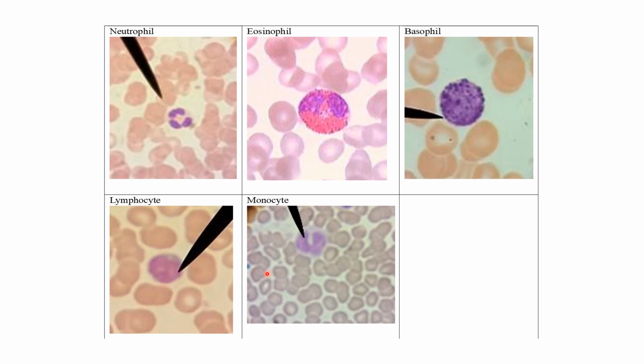Then in this slide we have a monocyte. In a monocyte, the nucleus is kidney shaped or U-shaped, and there is bluish cytoplasm. And these smaller cells are RBCs. You have to be able to recognize these slides. You can also find them in your Pearson e-text, and I also highly encourage you to go to PAL and have a look at the slides.